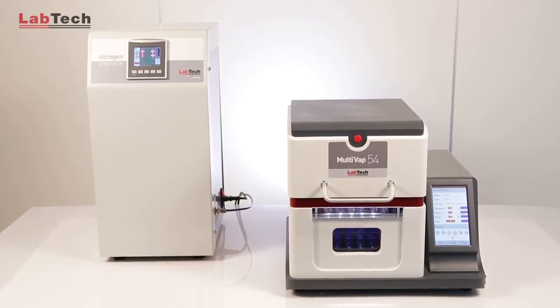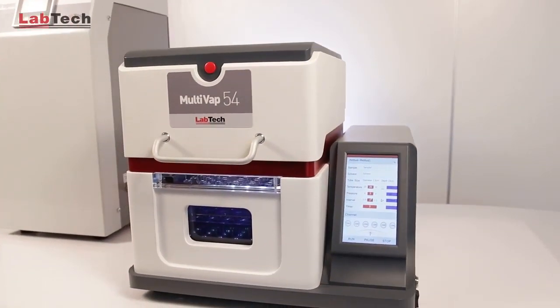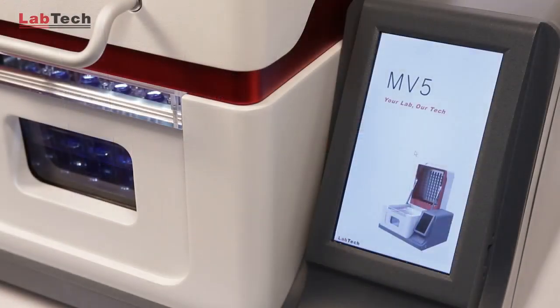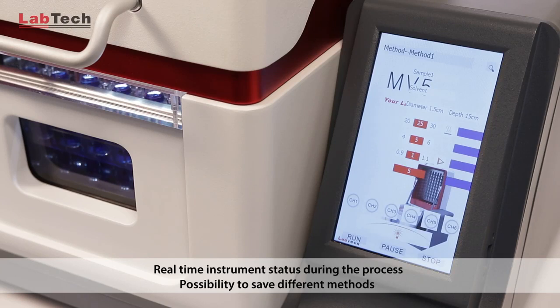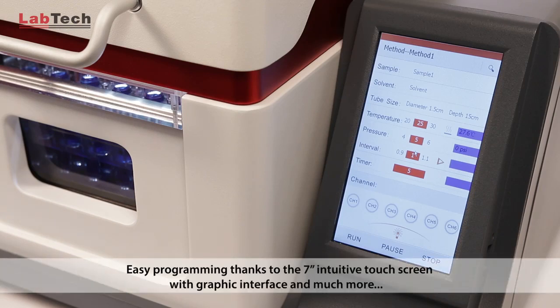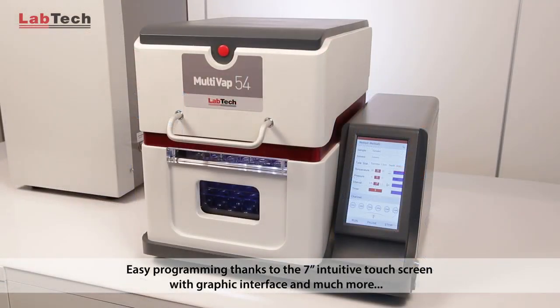Thanks to the intuitive touch screen with graphic interface, the operator can have real-time instrument status and control functions such as pressure, time, and temperature. Countless methods can be saved thanks to the easy programming function and the 7-inch intuitive touch screen.